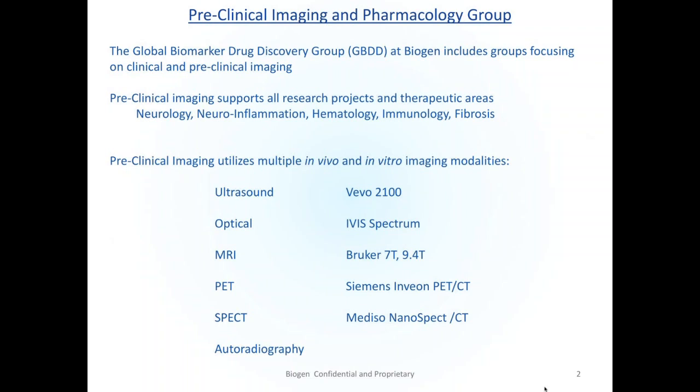The last point of introduction is to say that within our team, the preclinical imaging team, we have a number of imaging modalities. So we have a multimodal team with different specialties. Again, in the context of using imaging as a biomarker, as we think about the disease model that we're looking at or the questions that we're asking, we can consider which of these modalities would be the most effective at giving us useful readouts by imaging.